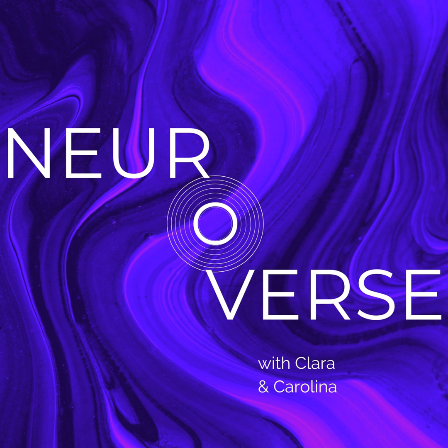So today we have our second episode in our series that is in collaboration with Scientifica, Tools for Looking into the Brain. And today we're going to be talking about fluorescence microscopy. So we're going to talk all about what fluorescence microscopy is, the different types of microscopy that we can use to look at microstructures, and how they can be used in neuroscience to help us understand the brain and the things within it.